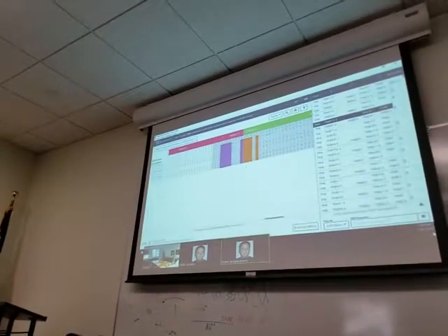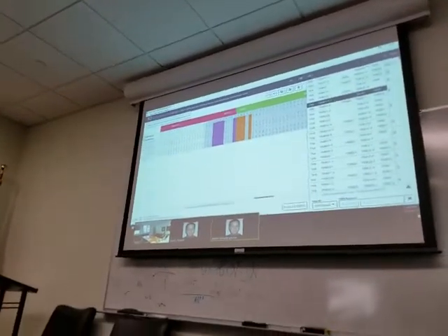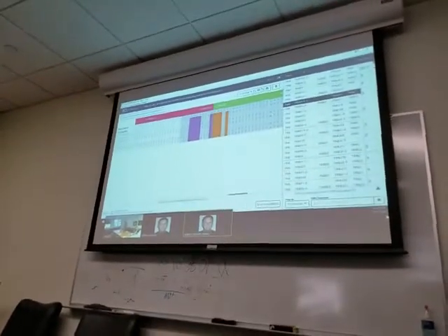It's still pretty manual, though, for sure. Unless you have particular motifs that you can search for, that you can do down here.